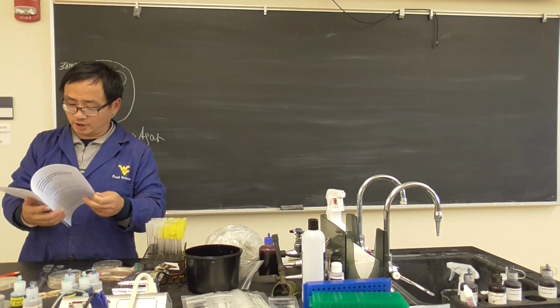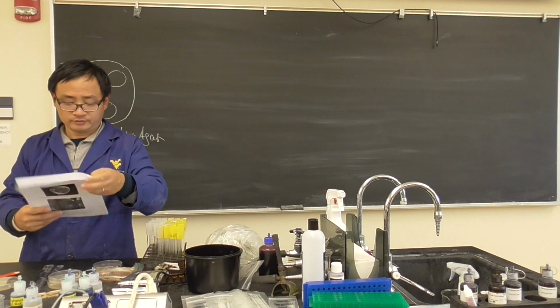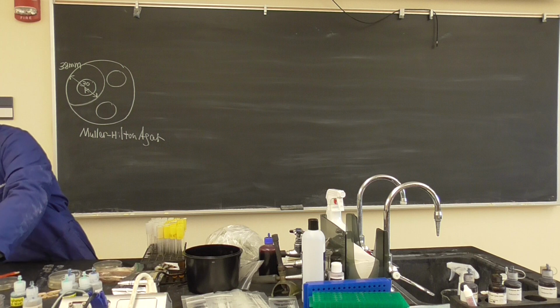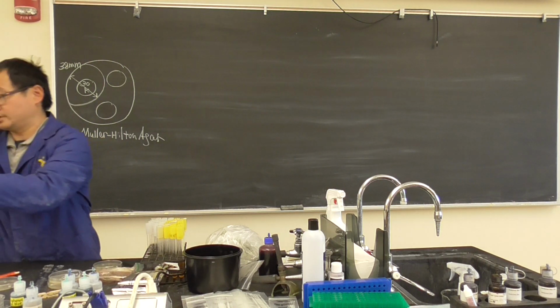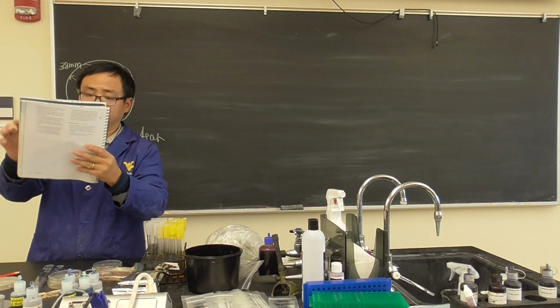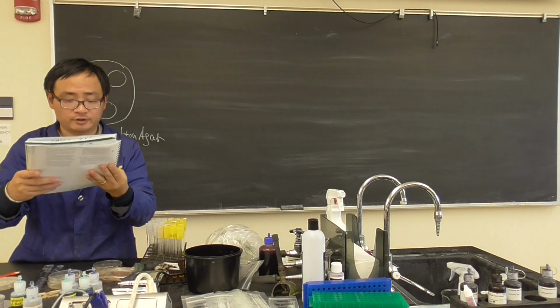Everybody look at your table. I don't have kanamycin here. Whether you can find it. I have one here. Let's see kanamycin, whether we can find it here. Okay, I have it. Kanamycin is right here. I'll leave this table here.